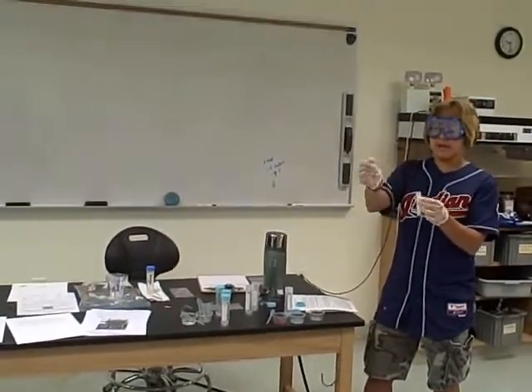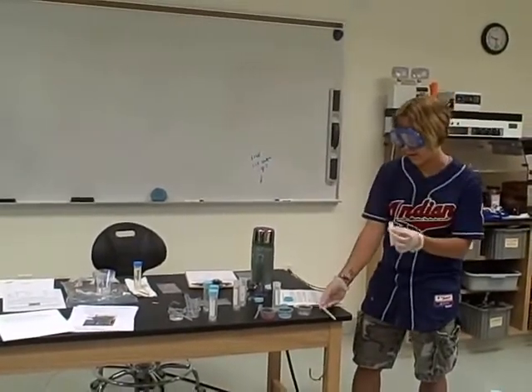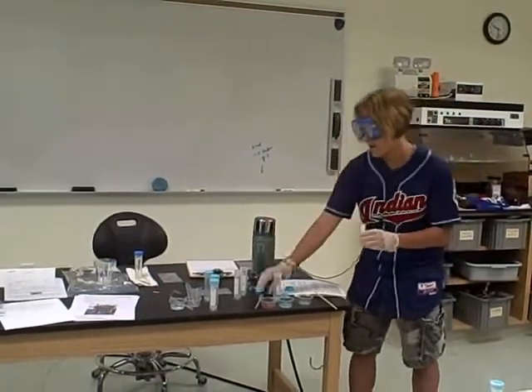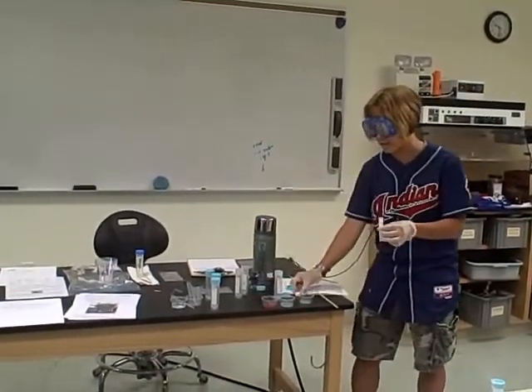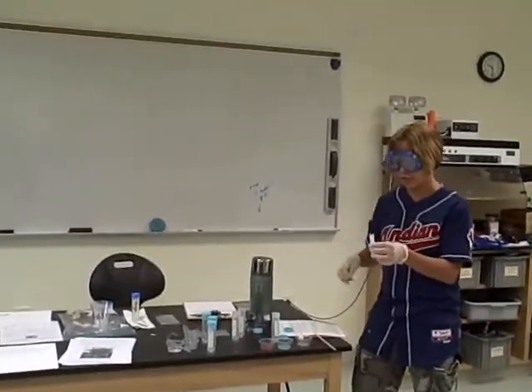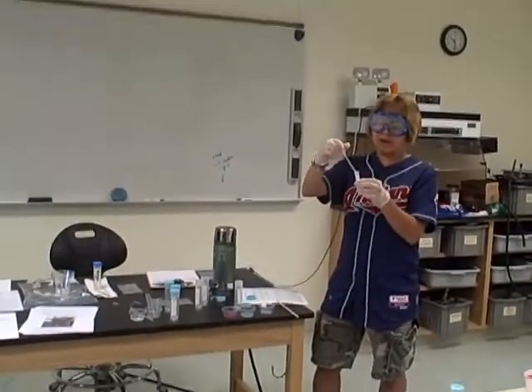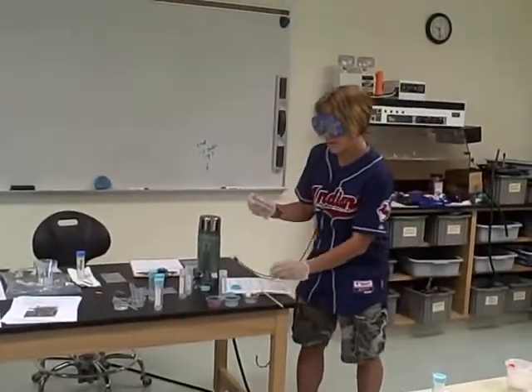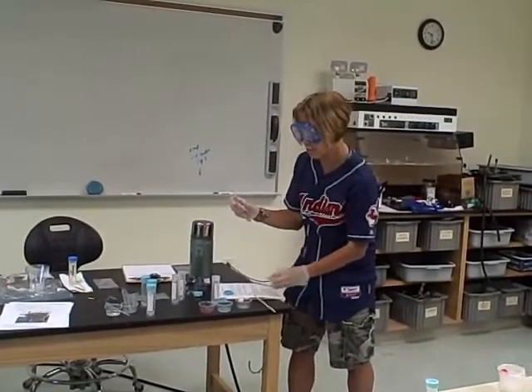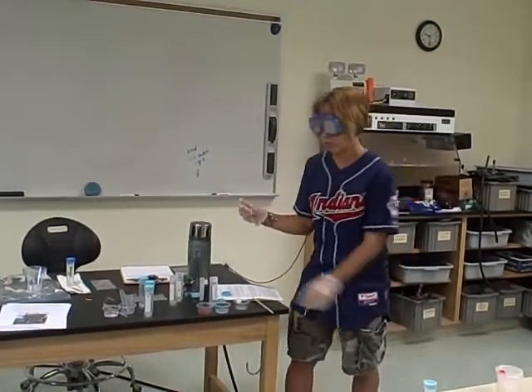So use the long stirrer basically to make sure that this goes in solution. It actually went in solution pretty well without me even doing anything. Again, because it's such a small container, the thing that we think about doing is capping it and shaking it. Please don't do that. Then what you're going to do is just dropper out a little bit, and literally, because the volumes have changed somewhat significantly, you do not need very much of this to demonstrate the result.